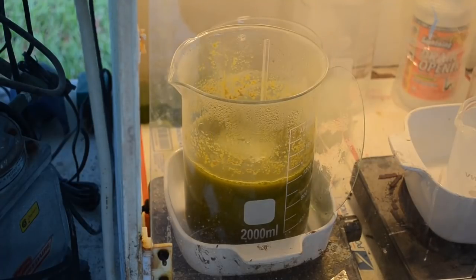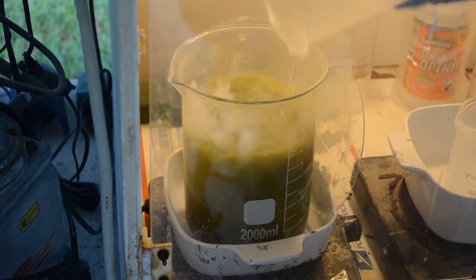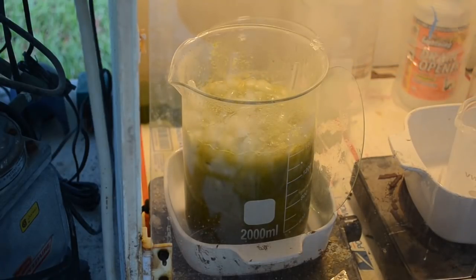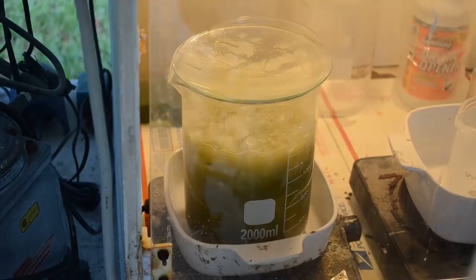Anyway, I almost forgot a step. We're not quite ready to filter yet. Some of you were probably yelling at your monitors. Don't forget the ice. I'll put the ice in there, let it melt, cool down, and dilute this.